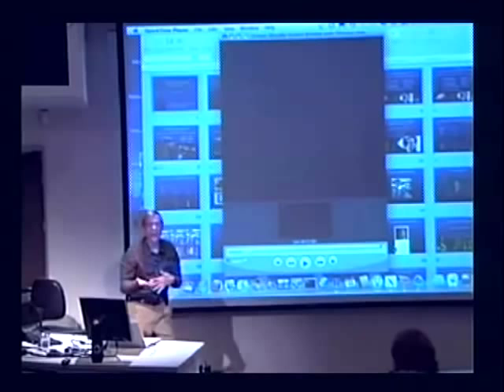However, we know something about what's above and what's below it, because we also, in our focal stack, have a slice in which that stuff is sharp. So if we have a slice where that stuff is sharp, we know what's here. And if we have a slice where this is sharp, and we have a blurry contribution by that, then you can imagine some kind of iterative procedure where we can remove the blurry contributions from each slice by looking at the other slices. So it's an iterative relaxation algorithm. It's known in the microscopy literature, and it's called 3D deconvolution.